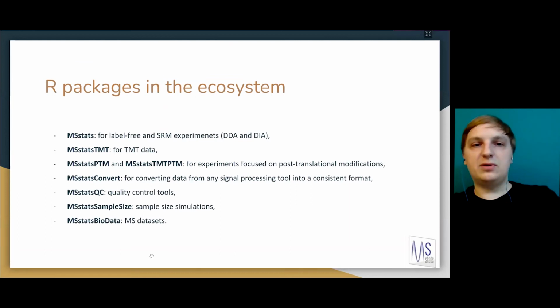Like I said, there are more packages in the ecosystem, but I will focus on the two main ones, or mostly the MSstats package, because the workflow in there is very similar to the other packages, and also on the new package, MSstatsConvert, which we developed recently.